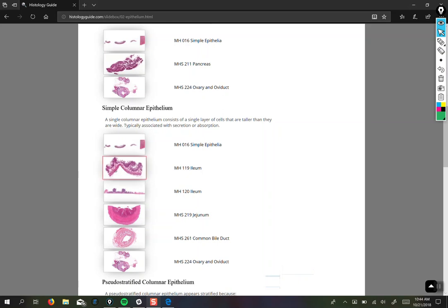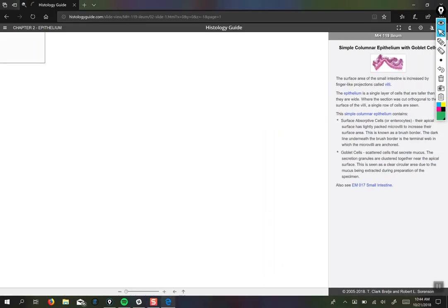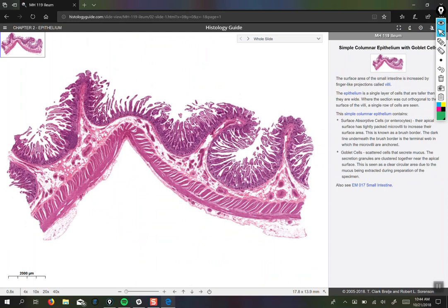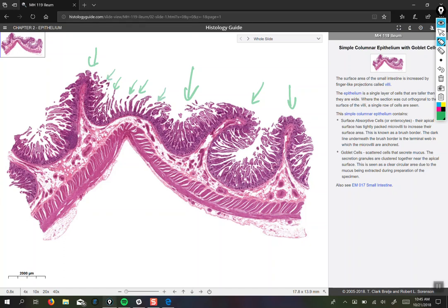For simple columnar epithelium, we're expecting to see a single layer of tall, skinny cells. With the intestine, you always want to navigate to the side of the slide that seems messier — but that's really where the epithelium is. These little folds are called villi. The folds are basically increasing the surface area of the intestine so that you have maximum absorptive capability. All of these little tiny villi are little folds of simple columnar epithelium.